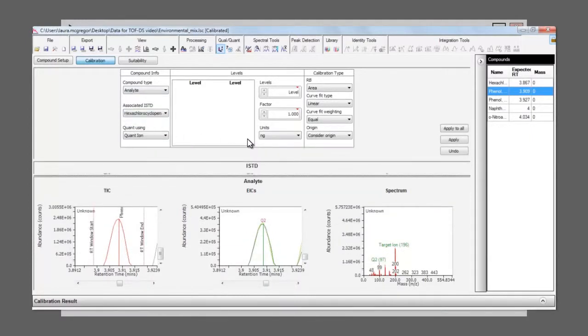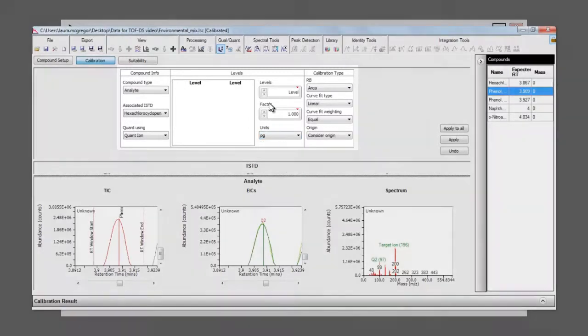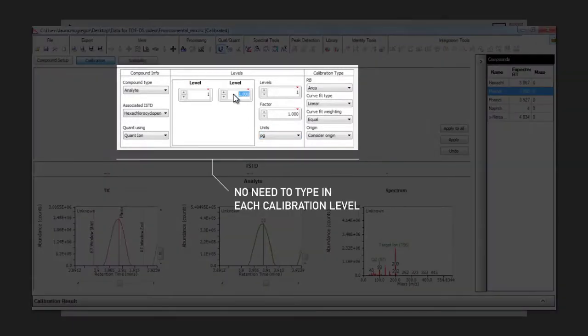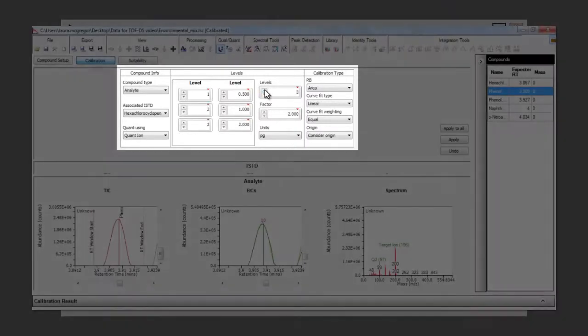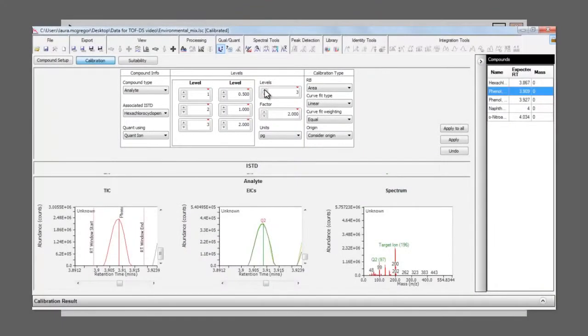To complete the concentration levels of each of the standards, we define the start point and dilution factor for the first one, and then when we add the next level, the concentration can be automatically calculated. This means you don't have to type in all the individual concentrations, helping to speed up the qual-to-quant workflow.